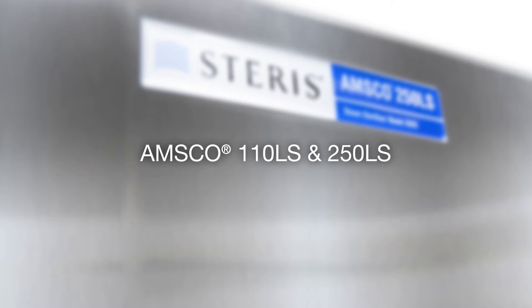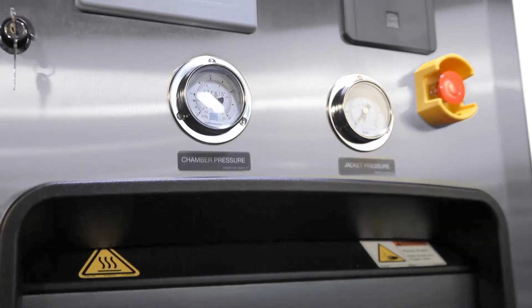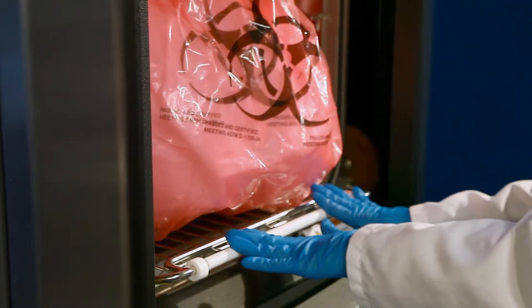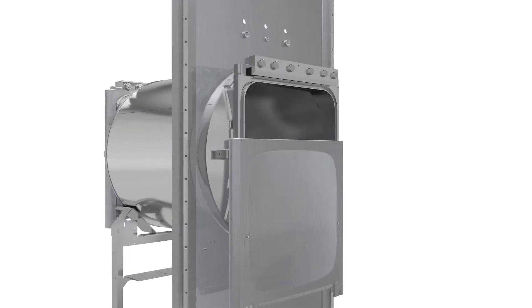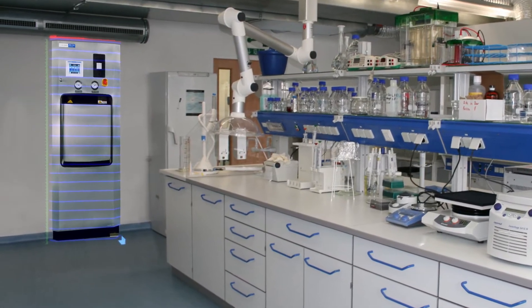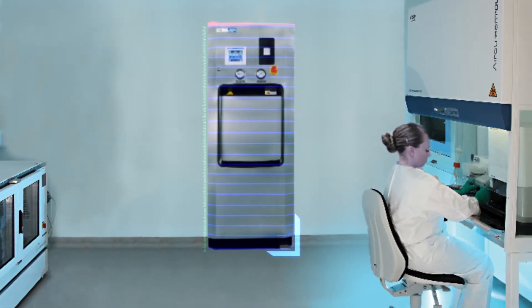The AMSCO 110LS and 250LS are the next generation of small laboratory steam sterilizers from Steris Corporation. From the media preparation laboratory to the BSL-4 environment, the AMSCO small LS series is versatile enough to meet many demands and applications. The robust bio-seal design and effluent decontamination provide the security required of high containment areas, while the compact footprint makes it an ideal autoclave in any research laboratory.